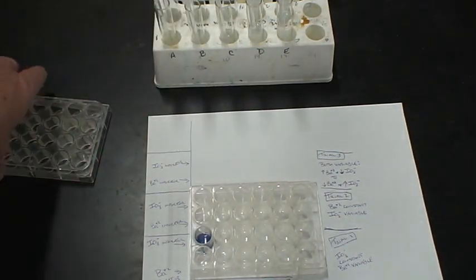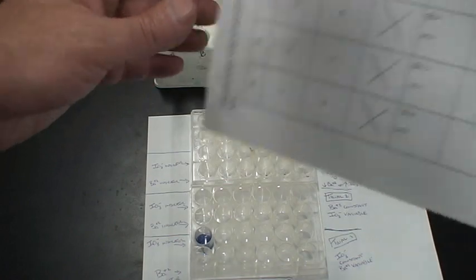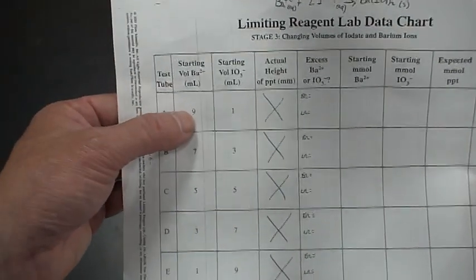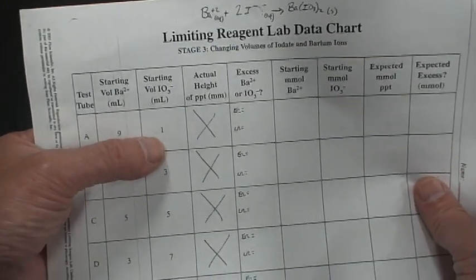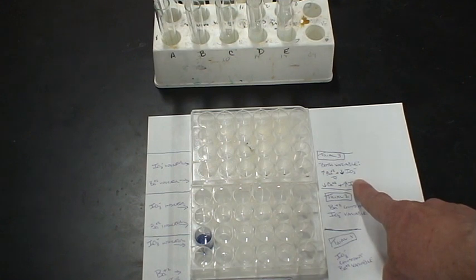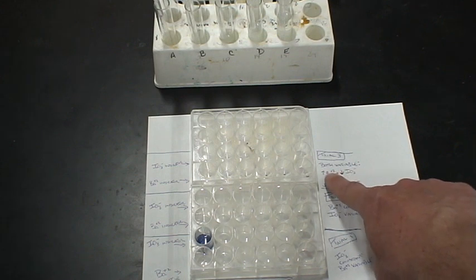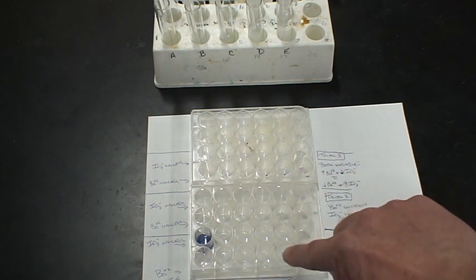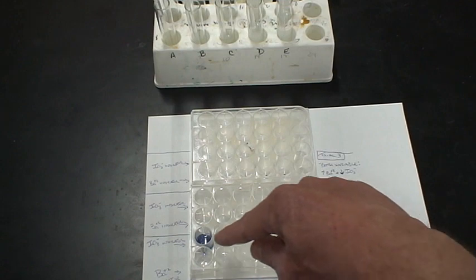In trial three, you'll notice I will have this set up. We're actually adjusting both of these. So we have two variables in stage three. We start with nine milliliters of barium and work our way down to one. We start high with barium, we start low with our iodate, and we're going to see an intersecting point. We gradually reduce this and gradually increase these, ending up in test tube E with a low amount of barium and a high amount of iodate.